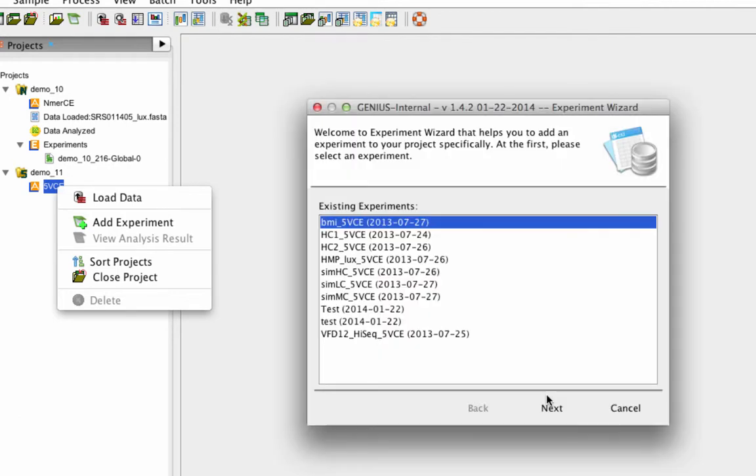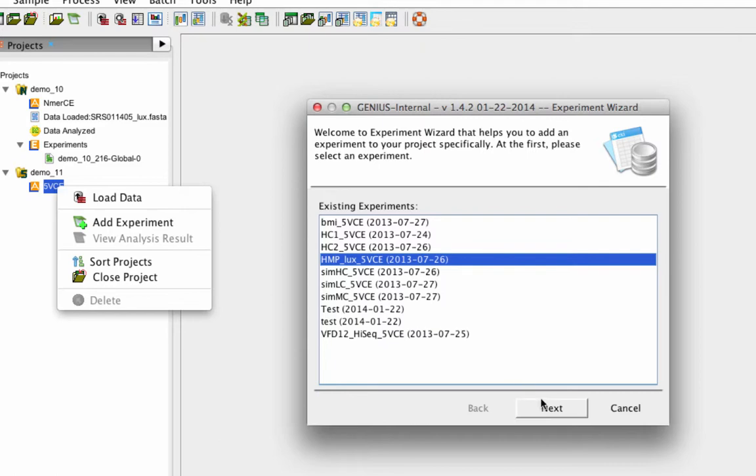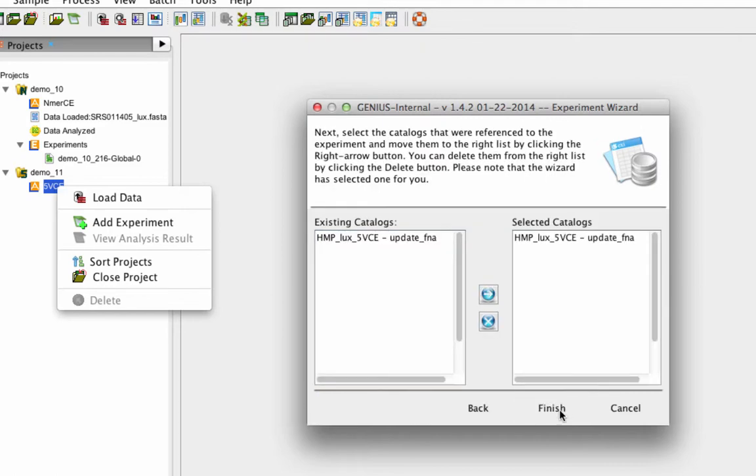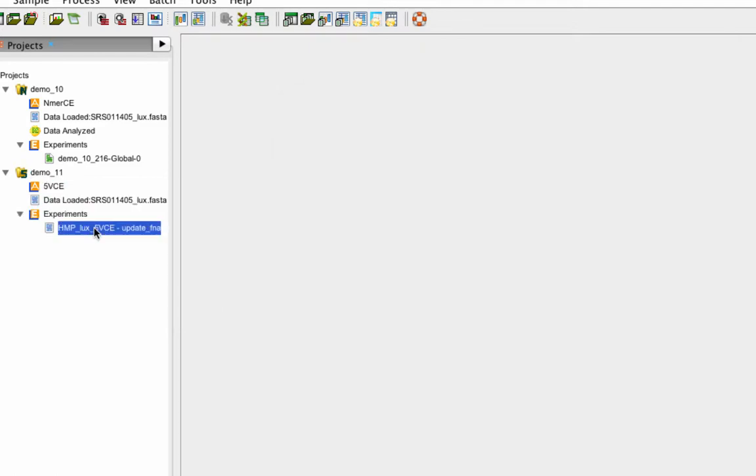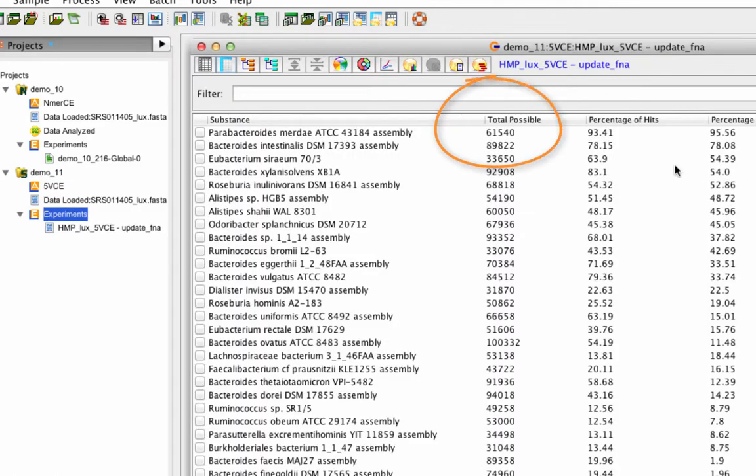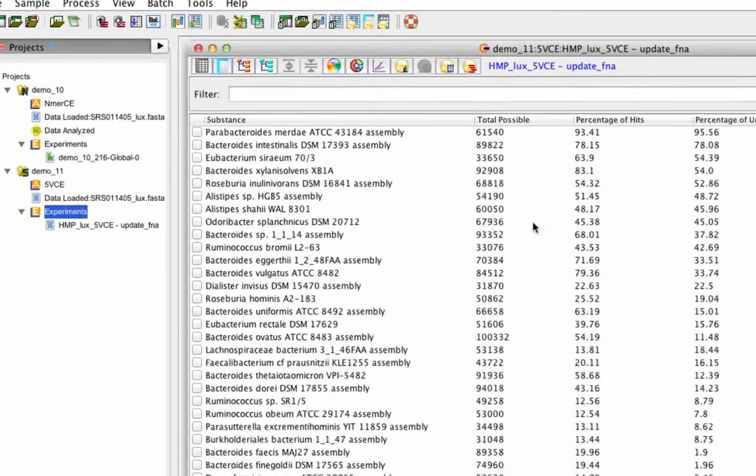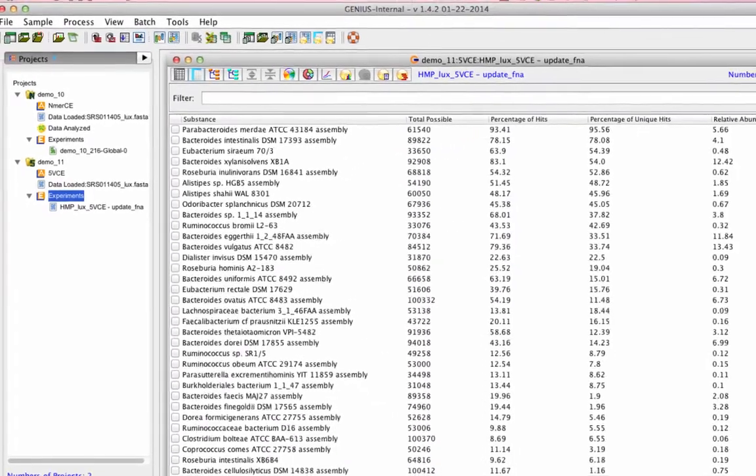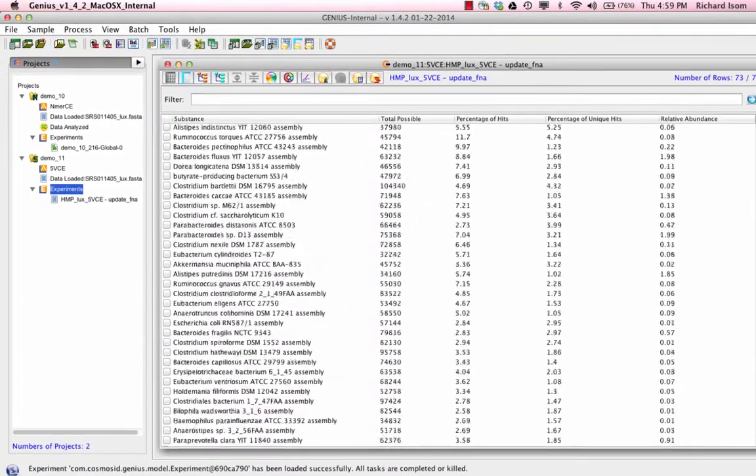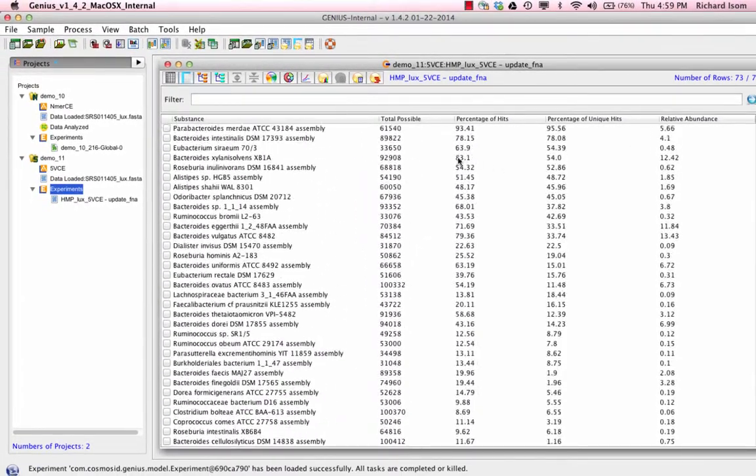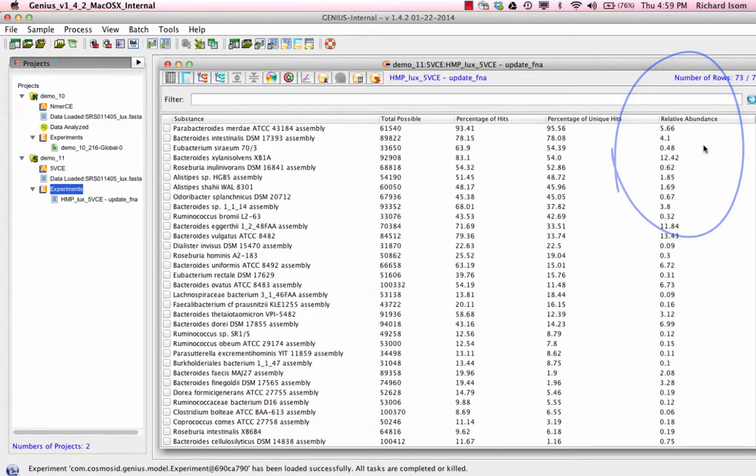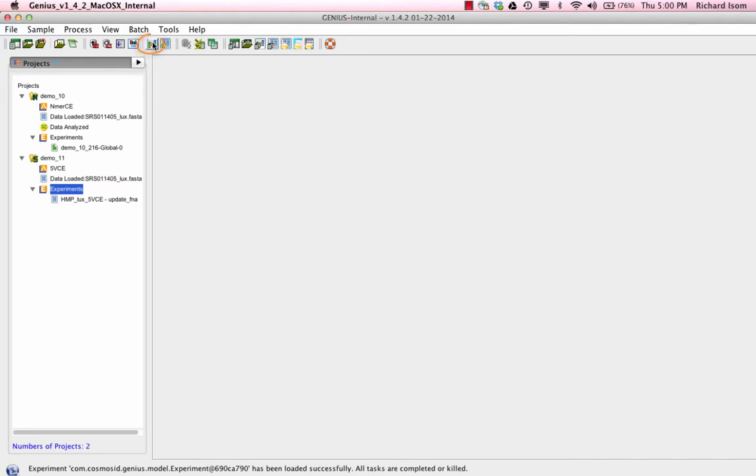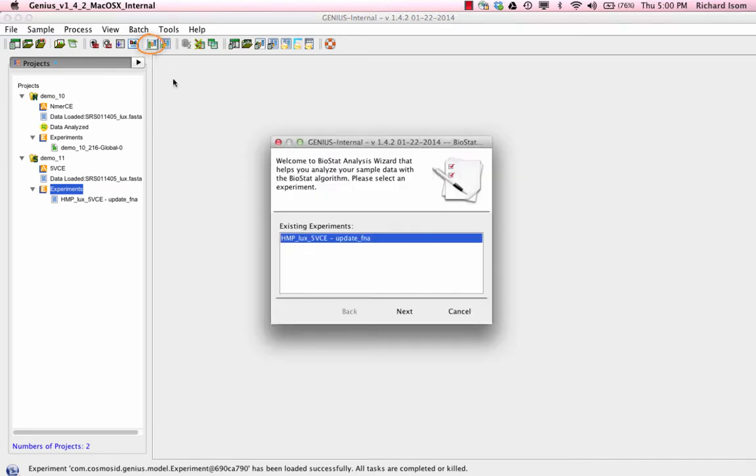The power of 5VCE is that it uses a huge number of biomarkers that are shared or unique across taxonomic levels and every possible genomic attribute has been used to make an identification. With these biomarkers and genome size, we have the opportunity to normalize relative abundance so it represents actual cellular abundance.